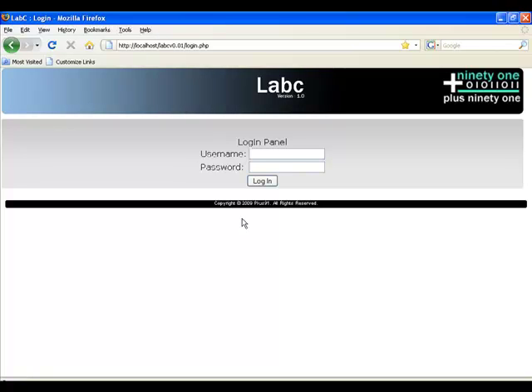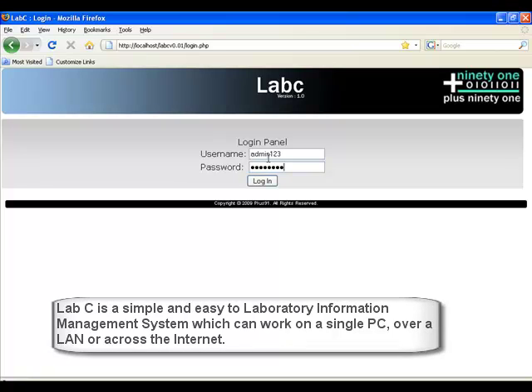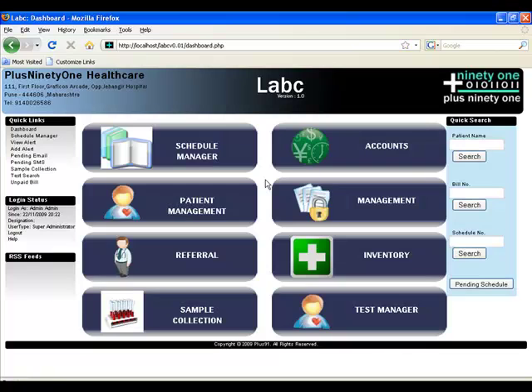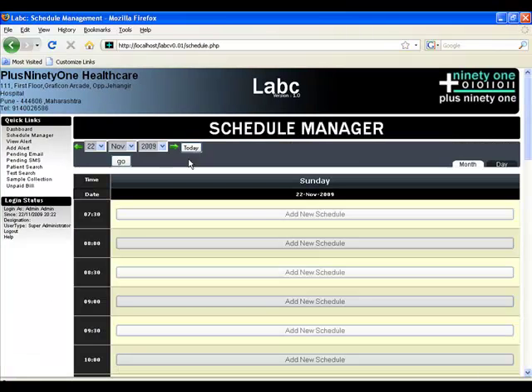Welcome to a demonstration of LabC, an easy to use and simple to manage laboratory information system for Plus 91 Technologies. As you can see, the user interface is very simple and easy to use.